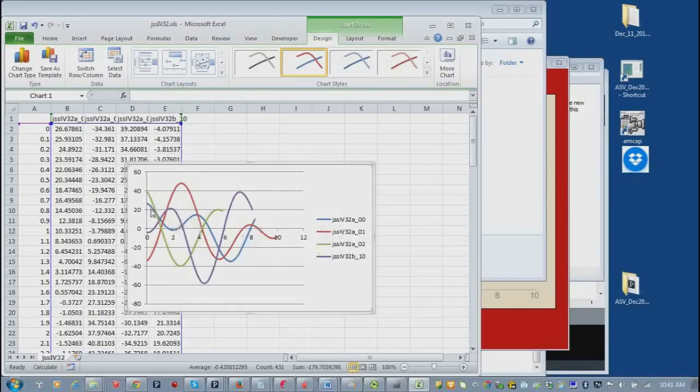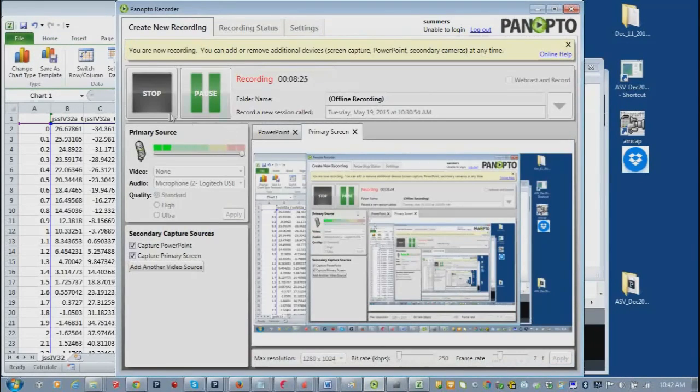This is the first experiment we collected, first data set. The red is the second data set, and so on. So it all seems to work pretty well, and the idea here is that we'll be able to use the code that we wrote to manage these dummy data file sets. We'll be able to use that in future graphic user interfaces and to improve the user experience using the WeStat and the Titromatic. We're going to incorporate this file system into those instruments. All right, I guess that's it. So thanks a lot.